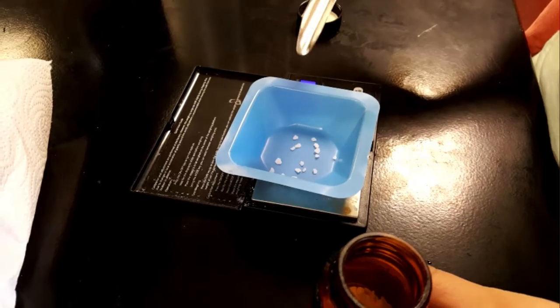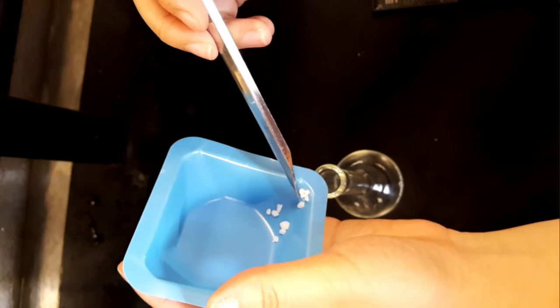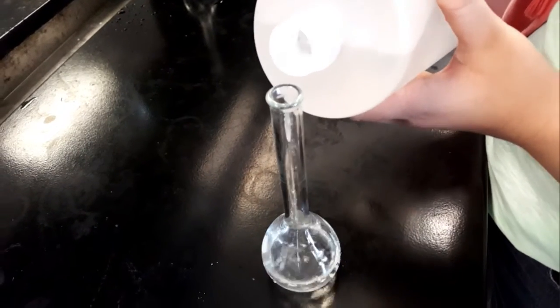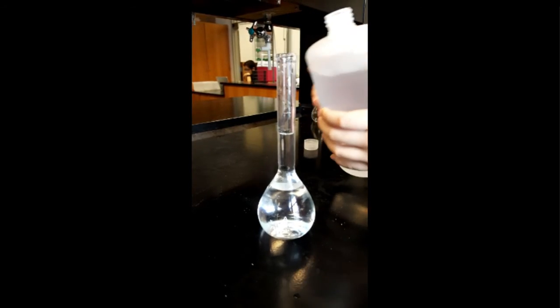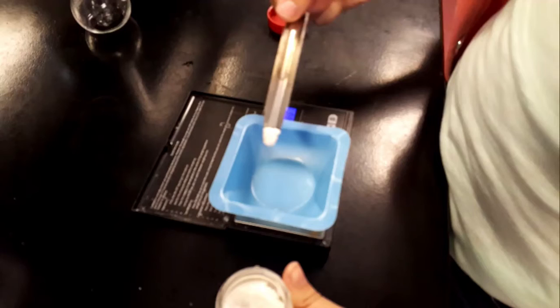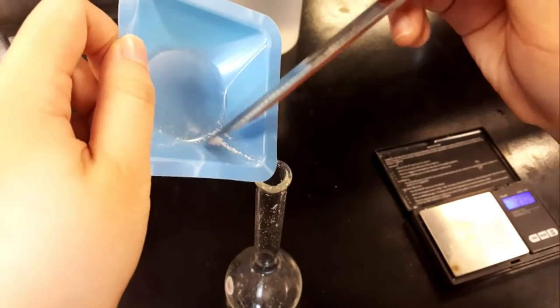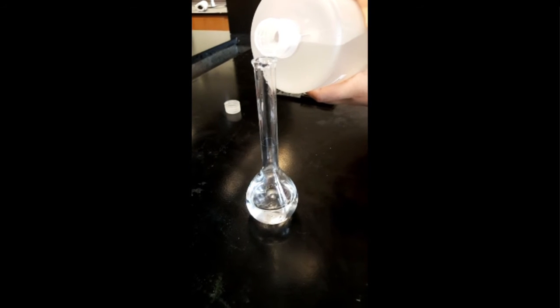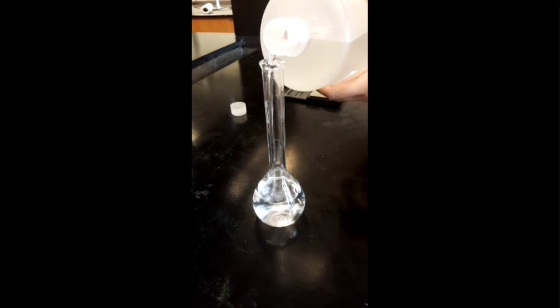Weigh out potassium iodide, then put it in the volumetric flask and dissolve it using a little distilled water. Then fill it up to the line to make a 100-milliliter solution of 0.2 molar potassium iodide. Weigh out lead nitrate, then put it in the other volumetric flask and dissolve it. Fill it up to the line to make a 100-milliliter solution of 0.1 molar lead nitrate.